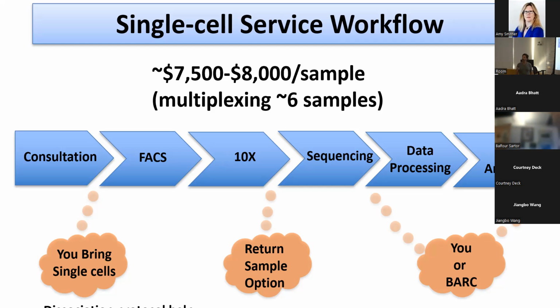We do FACS for you once you bring us the cells. Again, the cell dissociation part is your responsibility. Everybody has different samples, different tissues, different species. So it's your responsibility to isolate those cells and get them into as close to a single cell suspension as possible. We have dissociation protocols that we've developed over a number of years for different projects, and we can give you ideas on how to approach a particular tissue to get the best single cell suspension and also the highest viability. We do FACS to get them really to single cells.